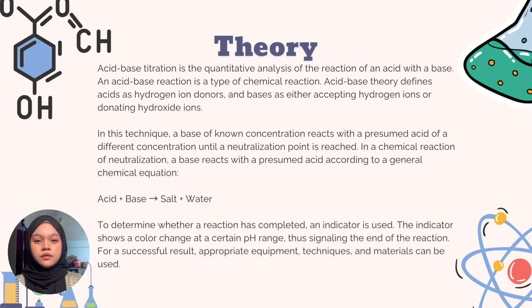Acid-base theory defines acids as hydrogen ion donors and bases as either accepting hydrogen ions or donating hydroxide ions. In this technique, a base of known concentration reacts with the acid of unknown concentration until a neutralization point is reached.